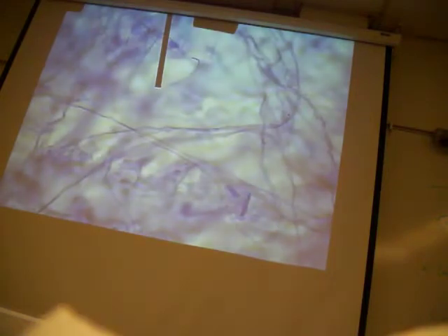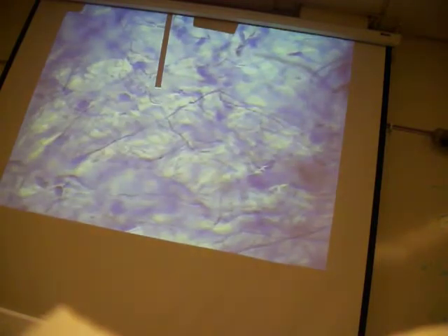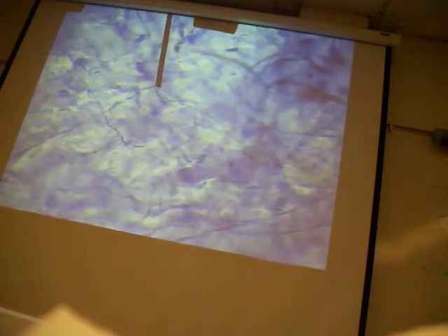So all those that are coming in focus, those are the elastic fibers. But it's this one right there at the tip of the pointer. See how it looks a little wavy on there? You can see these right here that look a little wavy. Those are the collagenous fibers, okay? Right. Does have a little give, but it's more resilient.